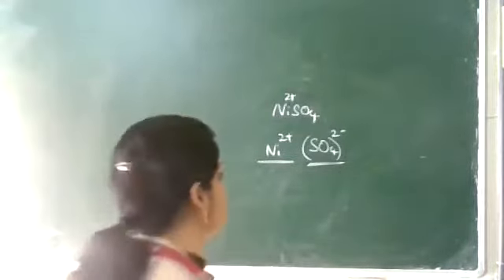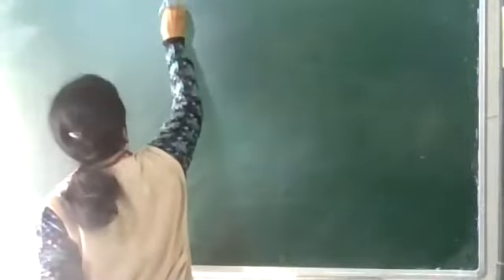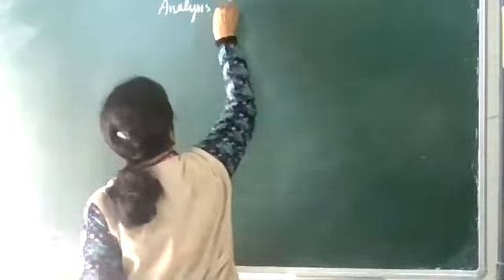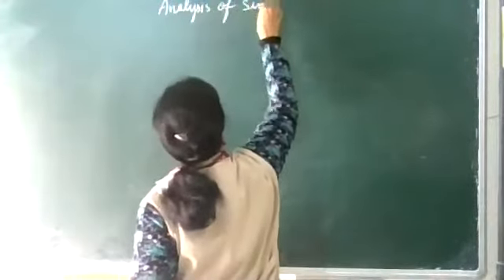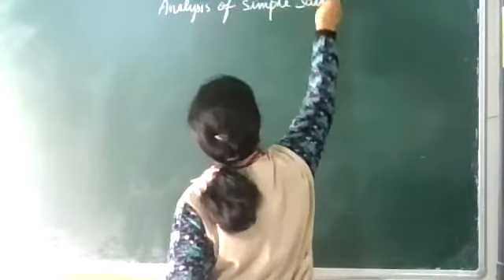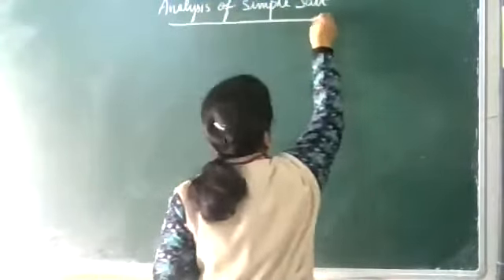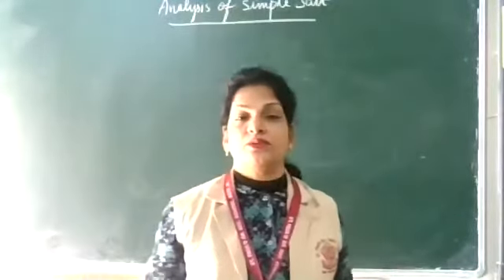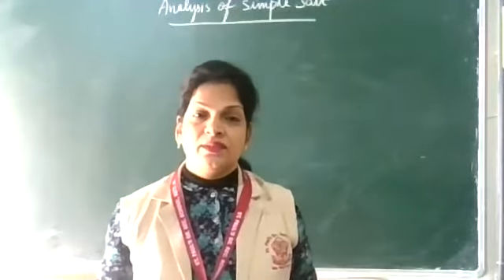First we write the heading: analysis of simple salt. Previously, the board used to give a mixture of salts, two salts.